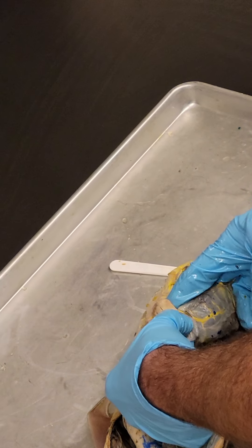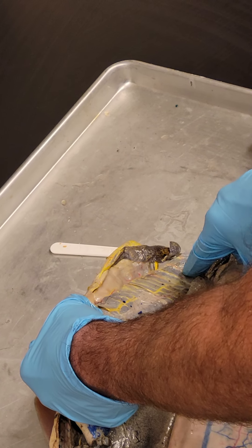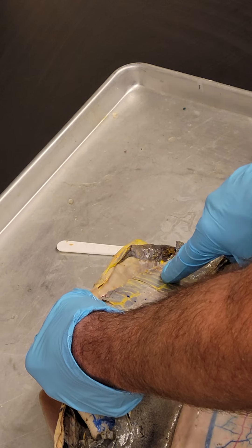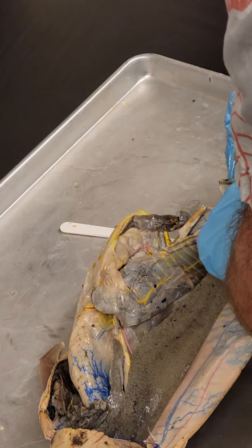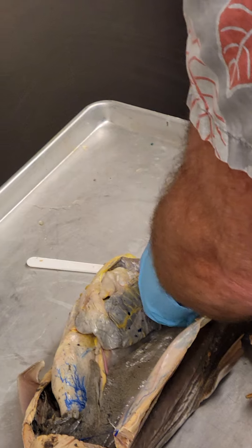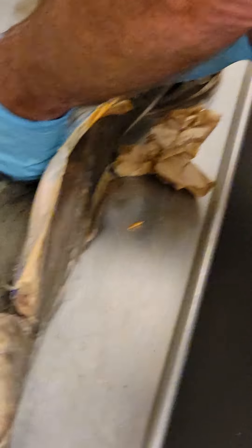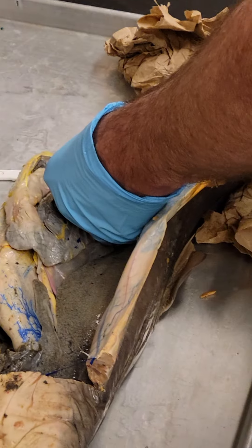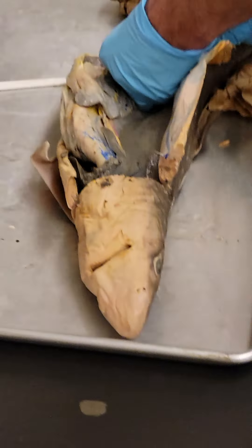This is the pancreas. This is the absorptive region of the intestine, the ileum. You can see all the vascular tissue — arteries essentially picking up nutrients and transporting them back to the liver. The colon is pretty short, and where the colon is, there's a rectal gland right here — a little rectal gland. Only sharks have this. It's an osmoregulation gland — they use it to regulate the osmolarity of their blood.